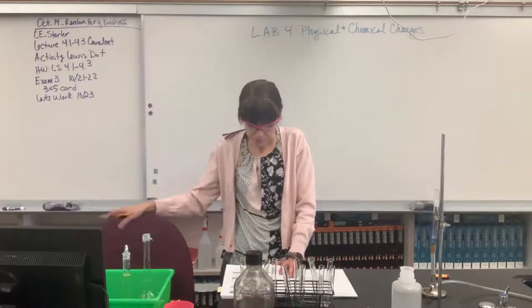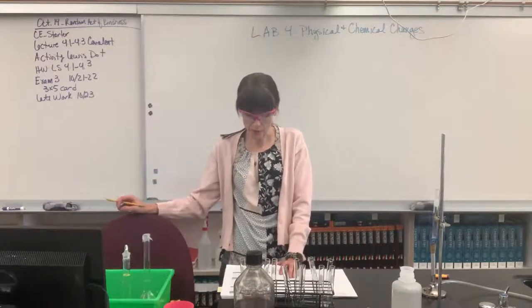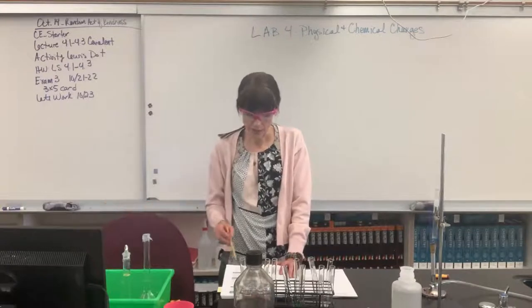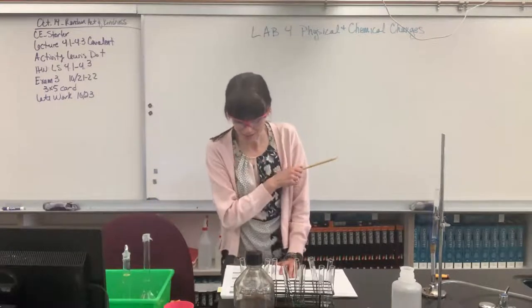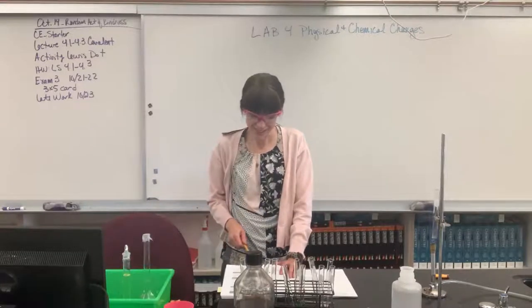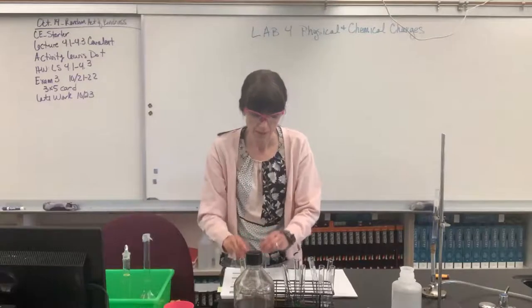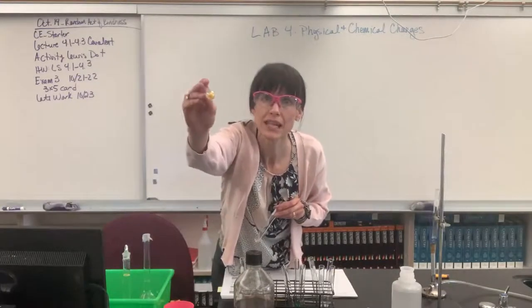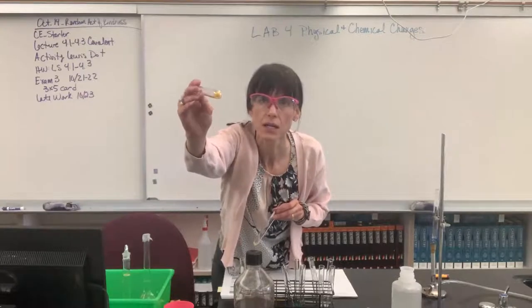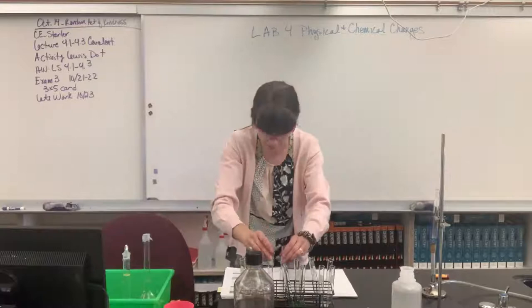So part C, it says, place approximately 0.1 grams of solid iron chloride, as FeCl3, they really should have said iron 3 chloride, we caught them, into each of the two dry test tubes. So here's iron chloride. Iron chloride is yellow. I'm hoping you can see that yellow color right there. It's yellow. So there's our iron 3 chloride.